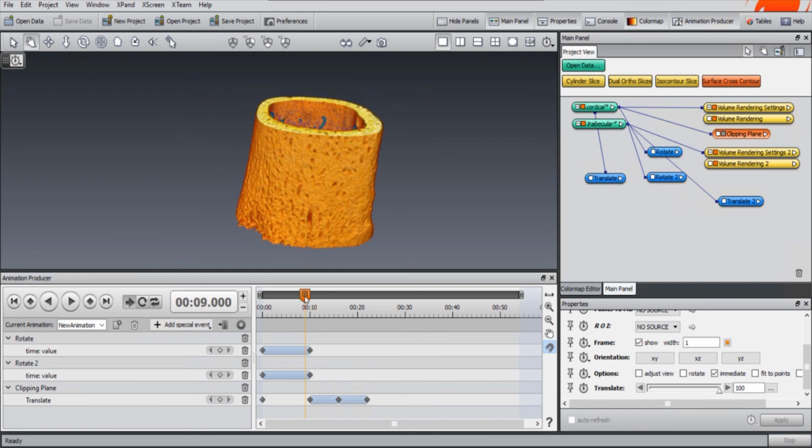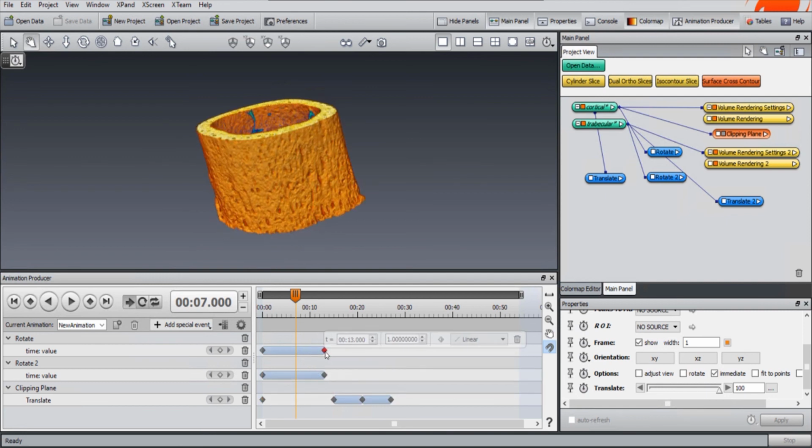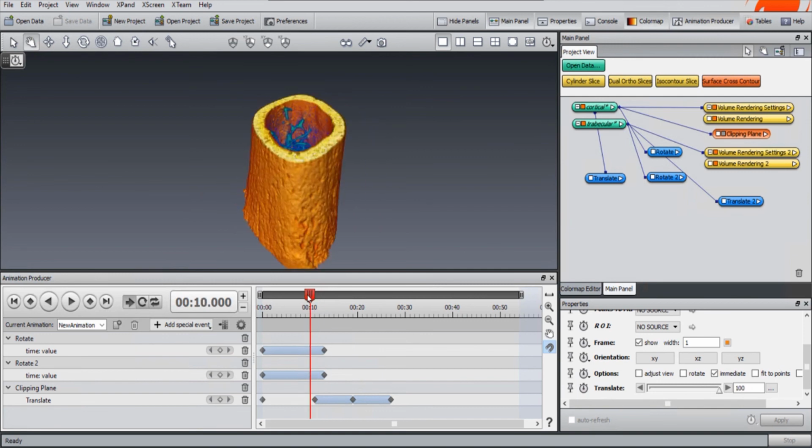Another thing I can do is change the position, like moving like this. Move this one to here. If I want to increase the time, I can increase like this. I can always make them overlap, like in the last, for example, 2 seconds, and make it even like this. So when I come here, I start to crop. It's almost impossible to notice, but still it crops.